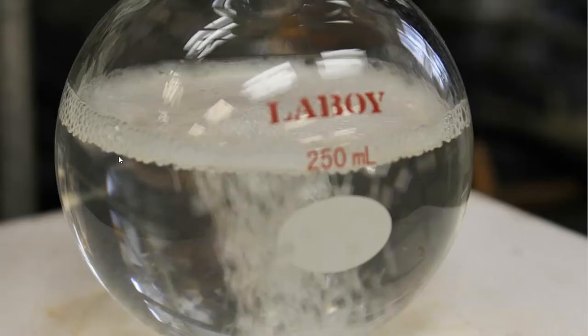Okay, so here's a close-up picture of the ether boiling. You can make observations if you want, if the lab book requires it. Nothing fancy or crazy is happening here. It just looks like boiling water, doesn't it? At least it does to me. So again, it's not going to take a lot of heat. This has a low boiling point, 40 to 60. So this is going to boil much cooler than water will at 100.